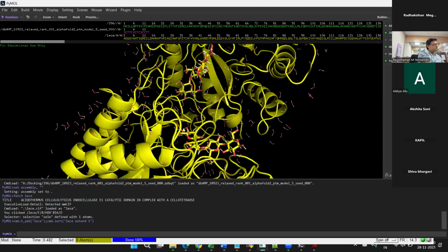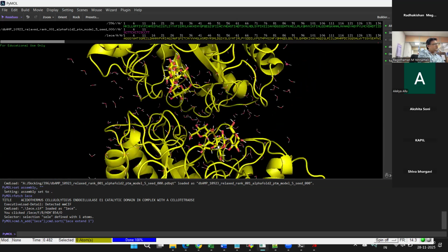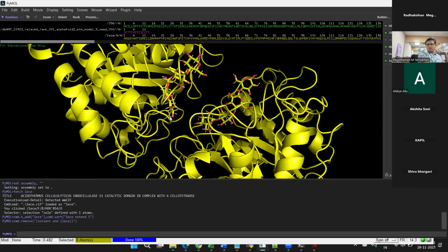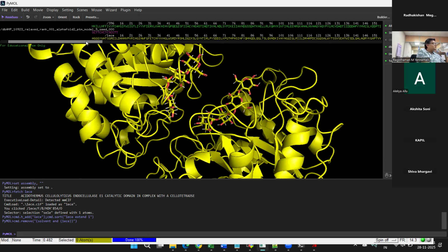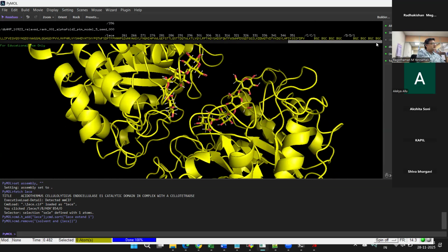So I have two chains here, and there is some kind of non-protein entity also bound with it. The easiest way is to click on the action menu and remove water, and water is removed, but that will remove only water. Now, if I scroll along the sequence, I will see at the end that there are these extra non-protein entities, and then I can just delete them.